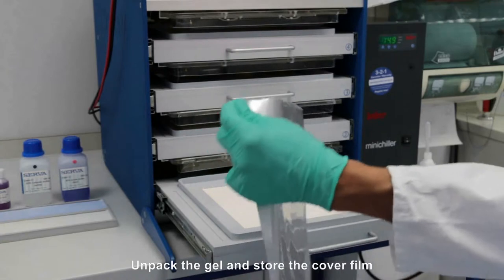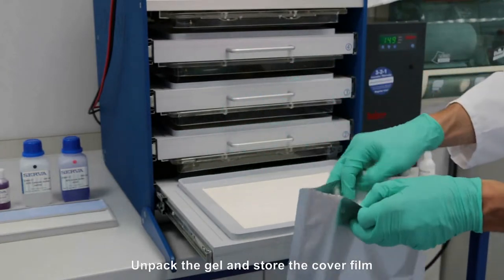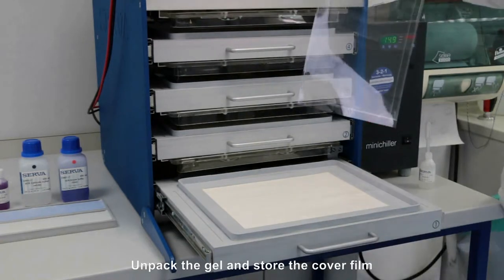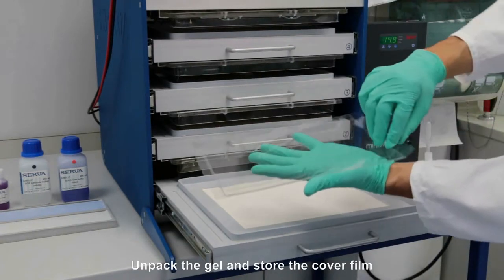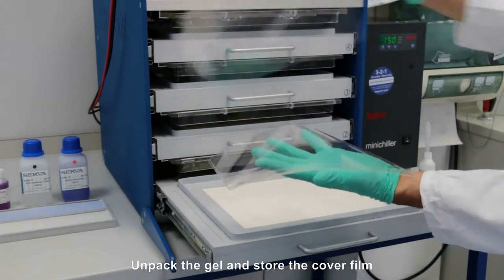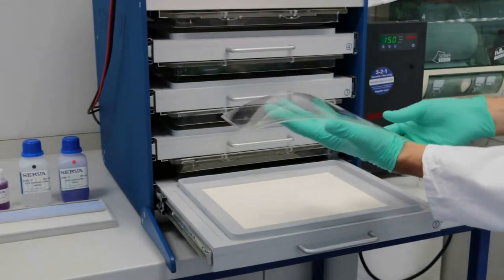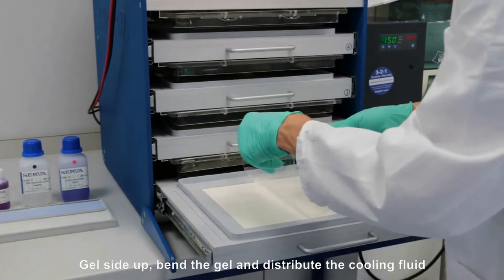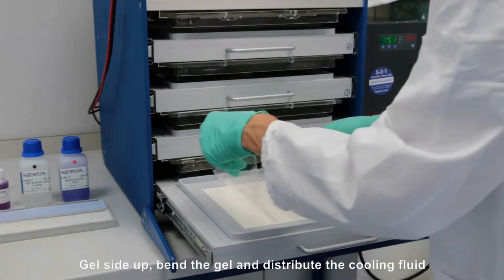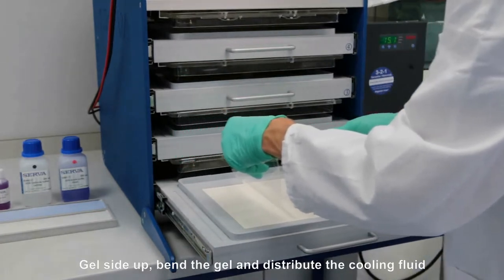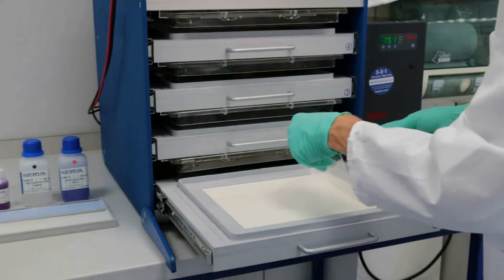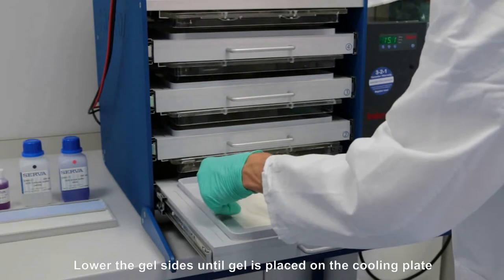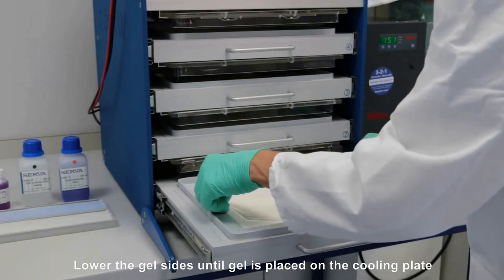Unpack the gel. For long term storage of the stained and dried gel, the cover film can be used, so don't throw it away. Gel side up and pre-casted slots towards yourself, bend the gel and distribute the cooling fluid. Lower the gel sides until the gel is placed correctly on the cooling plate. Avoid air bubbles.